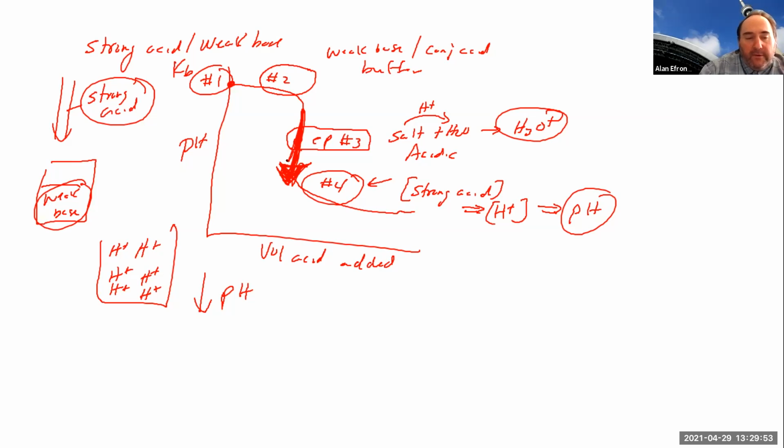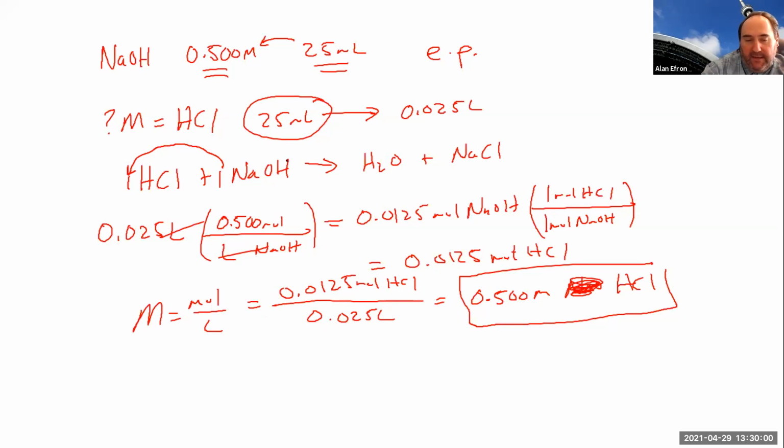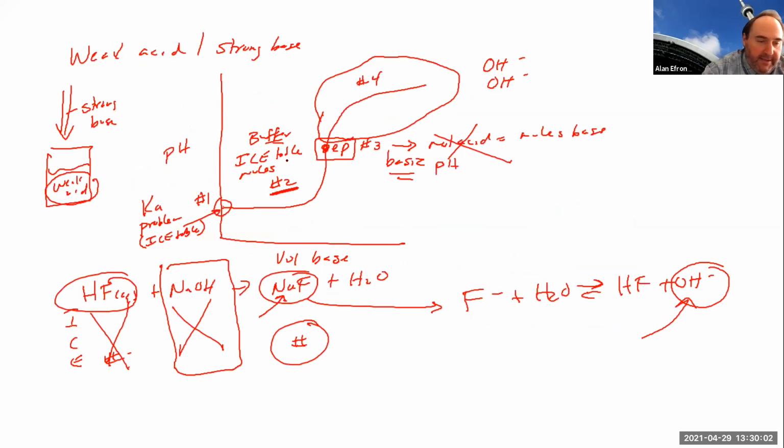sort of what we're going to be doing. We're going to be exploring titration curves. We're mainly going to be exploring these titration curves here, our strong acid, strong base, and our actually weak acid. Actually, we're doing strong acid, strong base, and weak acid, strong base titration curves. So the purpose of this experiment really is to construct the entire curve.